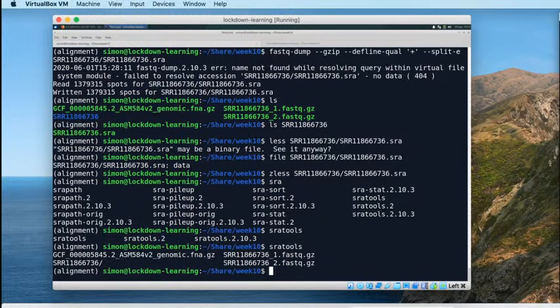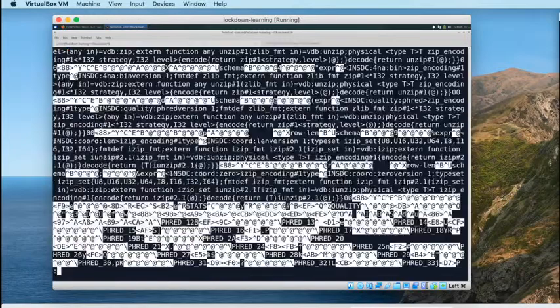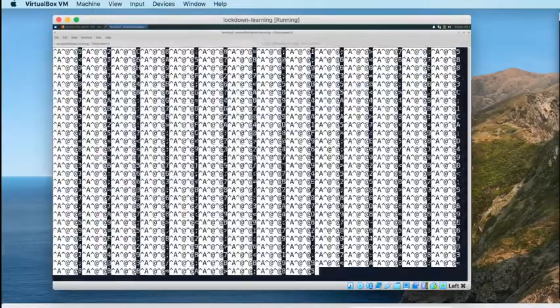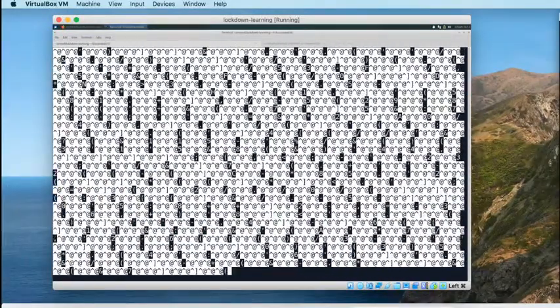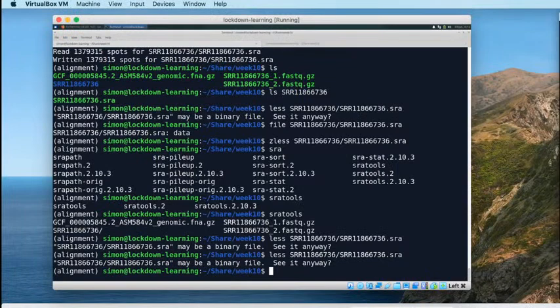Okay. So an SRA file. My experience of SRA files is that they have text in them, and that text is in a very different format to the FastQ, which was the point that I was going to try and illustrate by looking at the SRA file: the contents of that SRA file are very different to the contents of the FastQ file, and in order to convert it to FastQ, quite a lot of work has to be done, and you're relying on the annotation in the SRA file to reliably convert that data into FastQ. One of the things that I've experienced in the past is that in the SRA file, the data is recorded as spots.